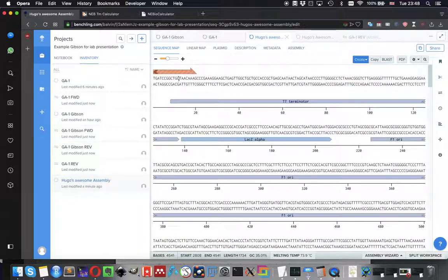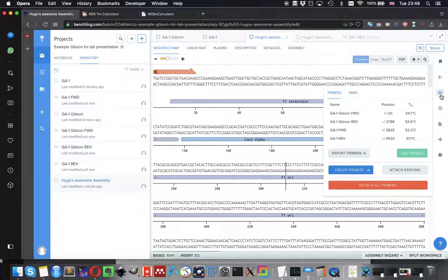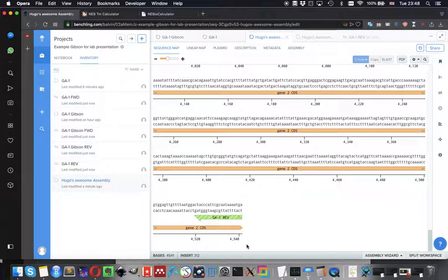So if we double click on it, we can see the full length of it. This is the part that binds, and this is the part that doesn't bind, that does homology, sorry. So we should have AGT at the lower end of it. Let's check if we have AGT correct. So it was going to have homology there.